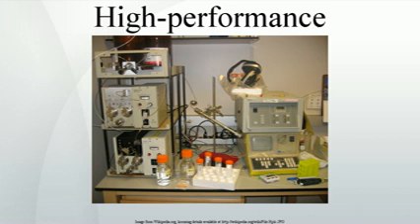In gradient elution, the composition of the mobile phase is varied, typically from low to high eluting strength. The eluting strength of the mobile phase is reflected by analyte retention times, with high eluting strength producing fast elution, equals short retention times. A typical gradient profile in reversed phase chromatography might start at 5% acetonitrile in water or aqueous buffer, and progress linearly to 95% acetonitrile over 5 to 25 minutes.